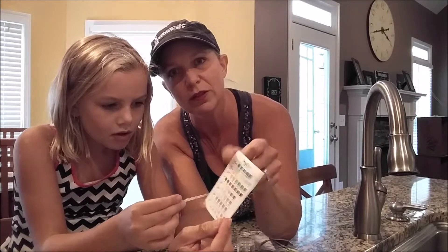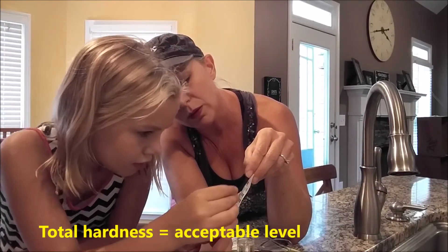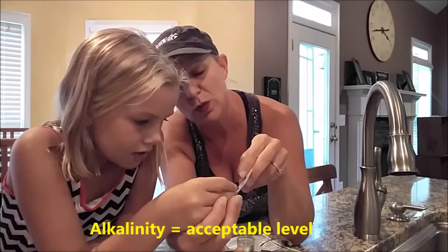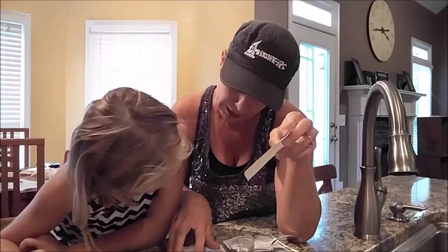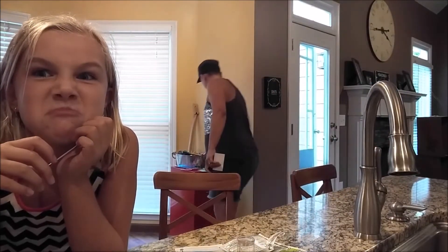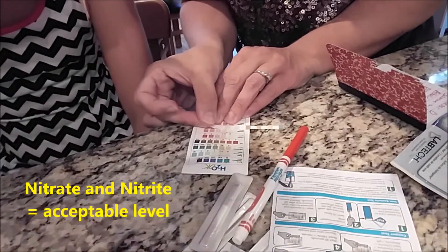The total hardness — let's see what color do we think that is. Do you think it's zero? Total chlorine right there, is one. Alkalinity, the next one, between 40 and 80. pH between six and seven. After 30 seconds, read the last two. All right, so they look like they're both in the okay range too.